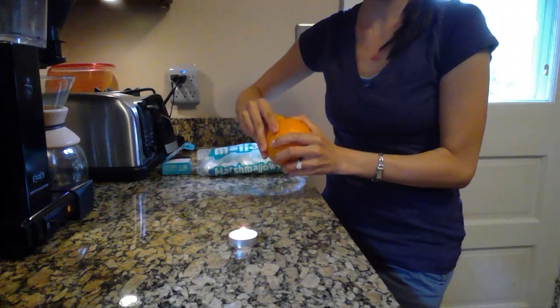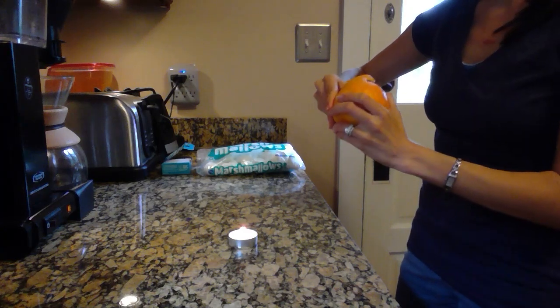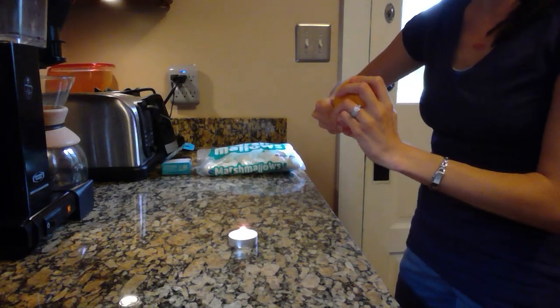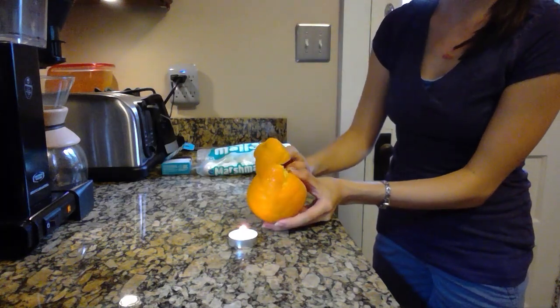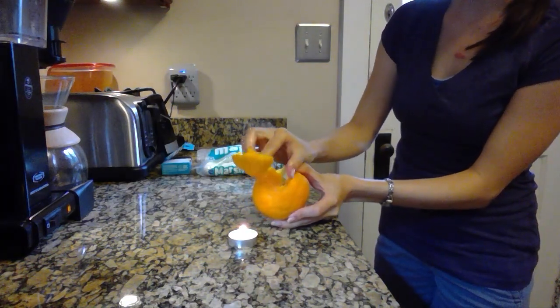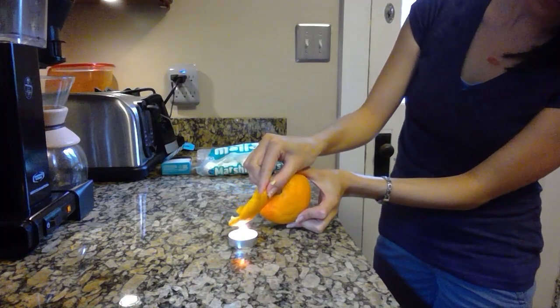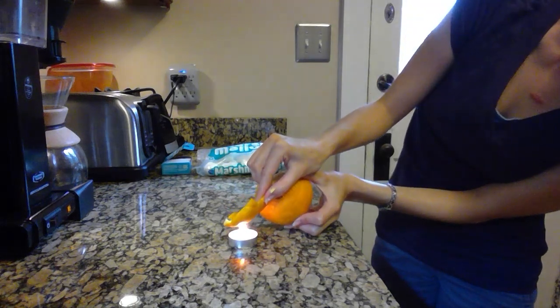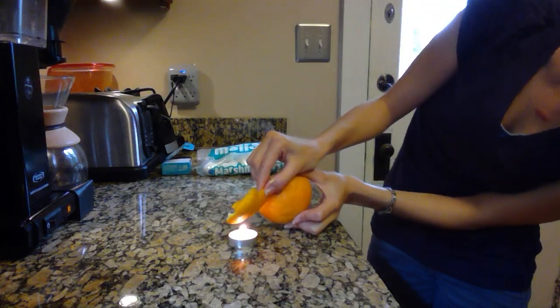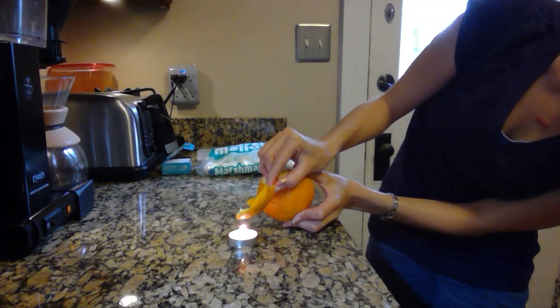So here we go. Hopefully you can all see my flame being lit and getting my peel started. And as always, make sure you keep your hands away from the flame. Be careful about that. And so you can simply peel it up and over and see what happens with your spark. You might need to hold it there, move it around a little bit. Okay. And you want to look at anything that might be happening.